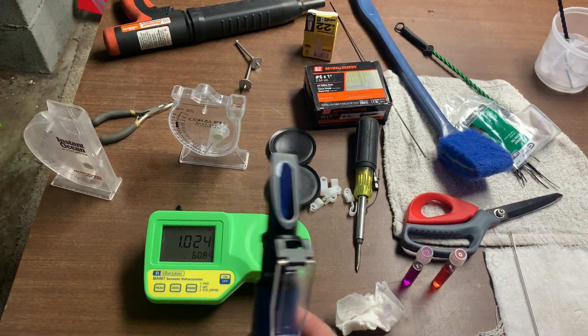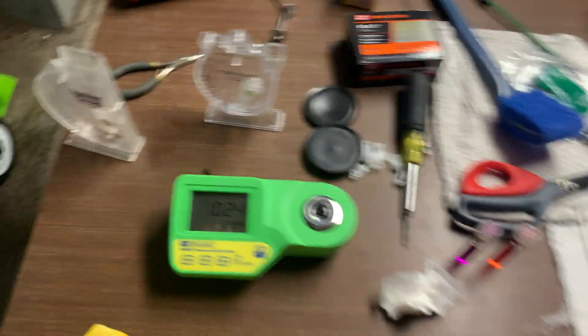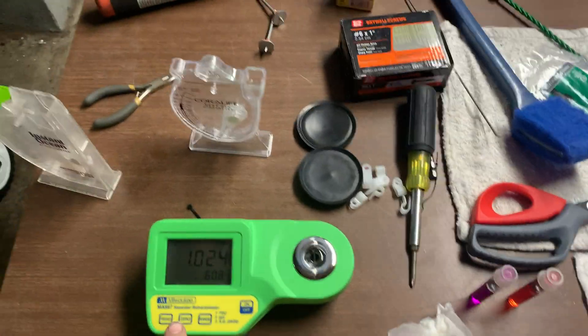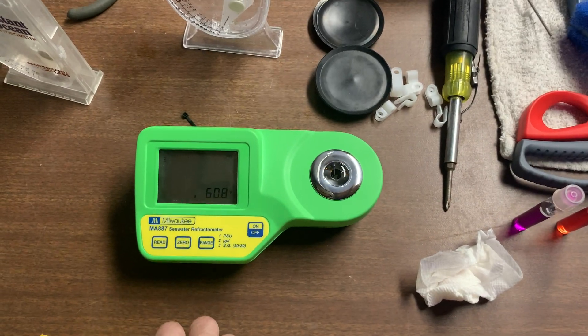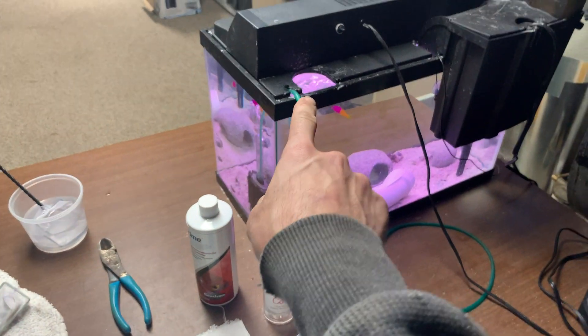And as long as they're both within each other of almost identical readings, that's it. I don't trust any of these meters by themselves. Let me hit it again. And the thing is, this here is 1.023.